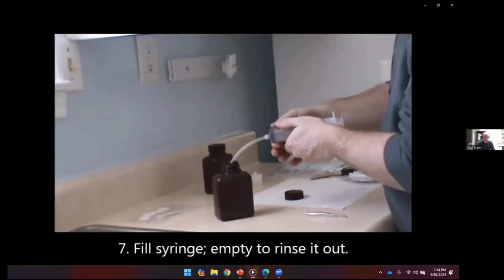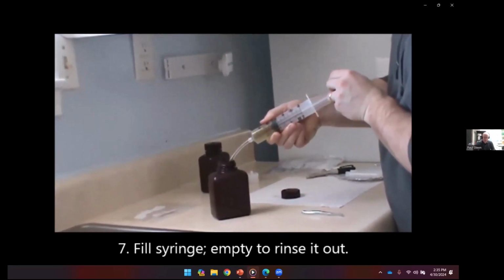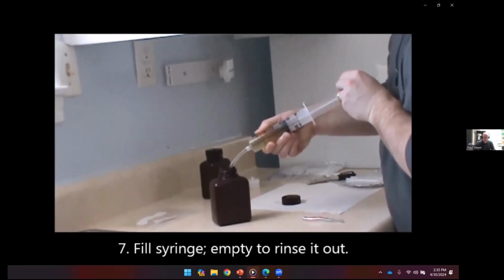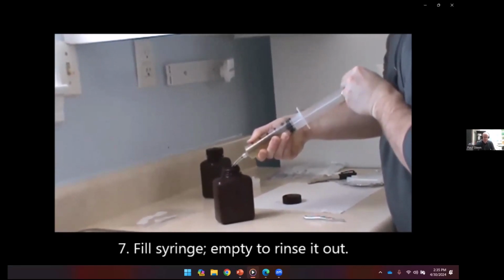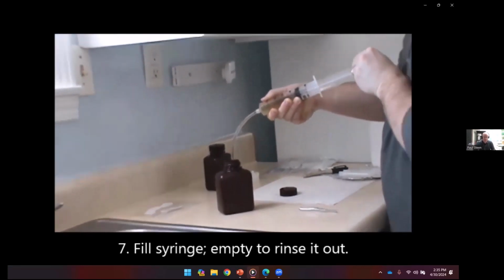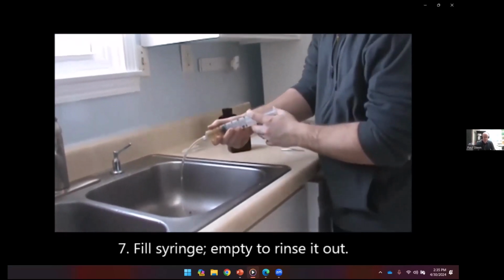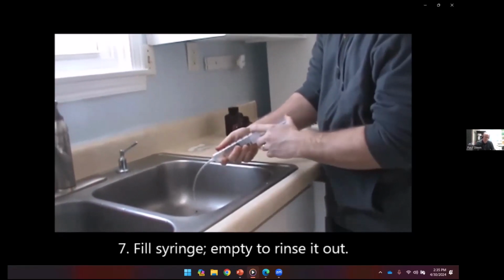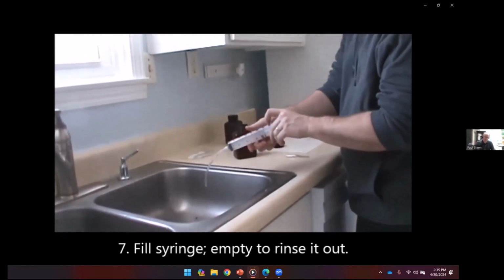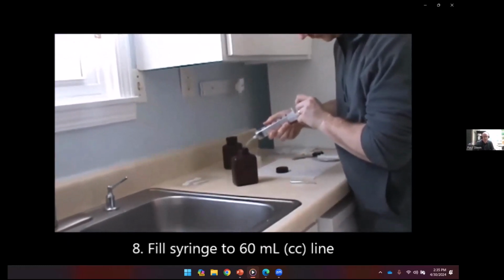Rinse the syringe by drawing up sample water until the syringe is full, and then empty it. Then fill it up to the 60 milliliter line.